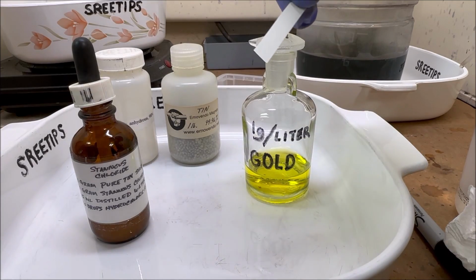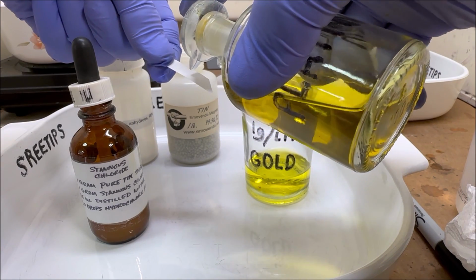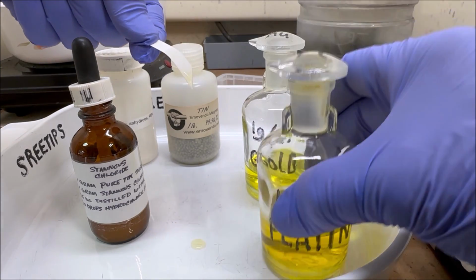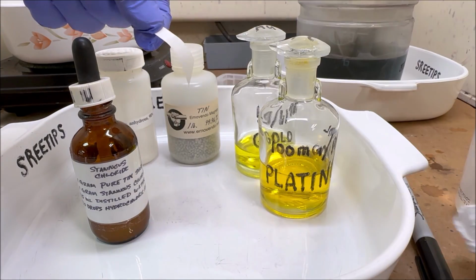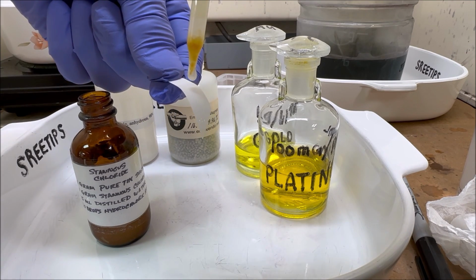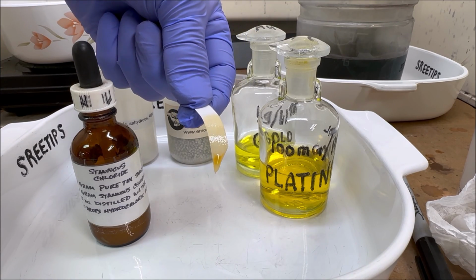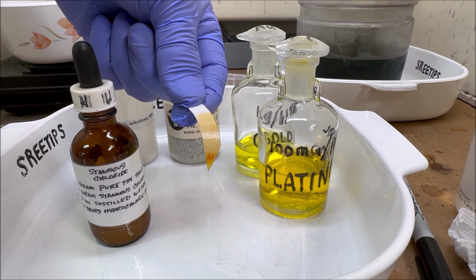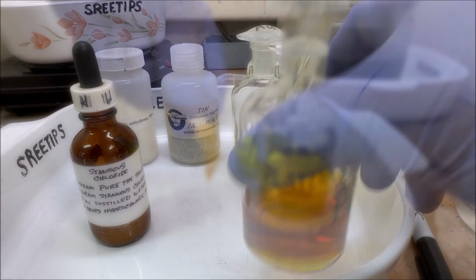All right, let's do one more test. Get a piece of filter paper. I've got some platinum standard testing solution. Put a little bit of this on our piece of filter paper here. And we'll use some of our freshly prepared stannous. We should get a color reaction here. It should turn orange, which it does. That's verification that we have platinum in solution, and that our stannous chloride testing solution that we just prepared works properly.